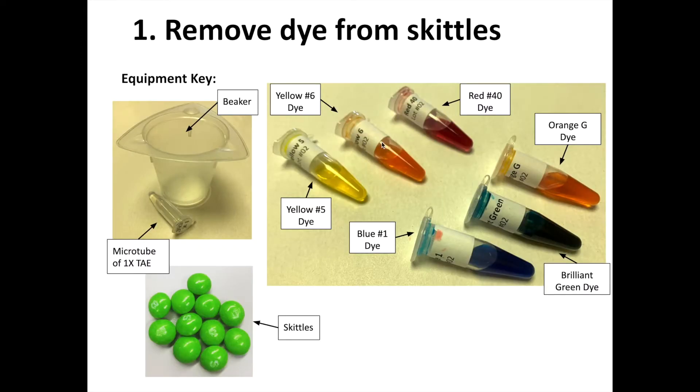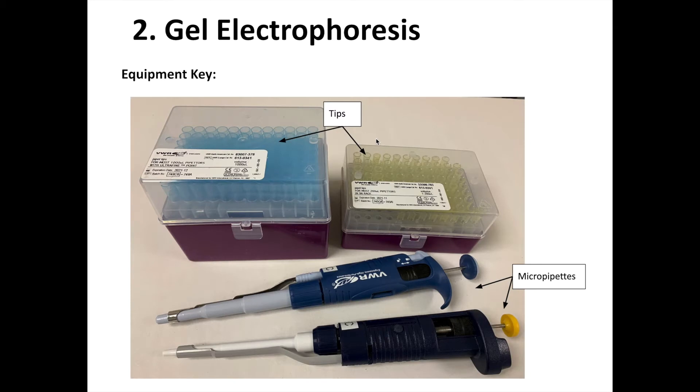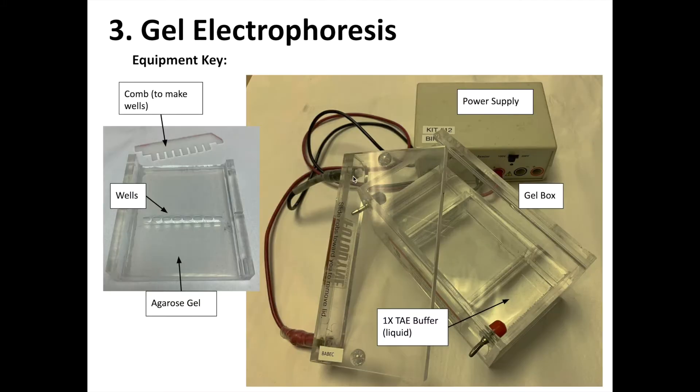Here are the materials we used to remove the dye. Now to do the gel electrophoresis, we'll need our tips for our micropipettes. Here is our agarose gel, and we use this comb to make wells, little holes inside of the gel. And we're going to place that gel inside of a gel box.